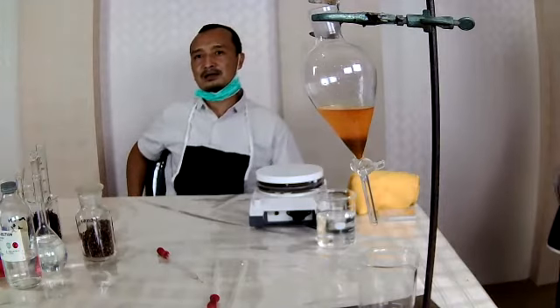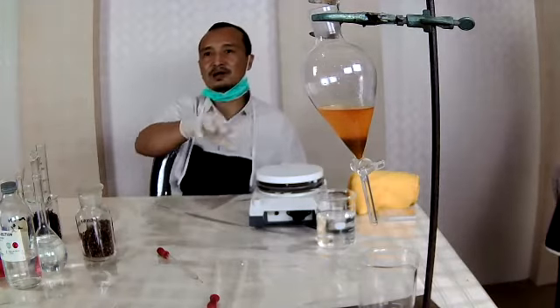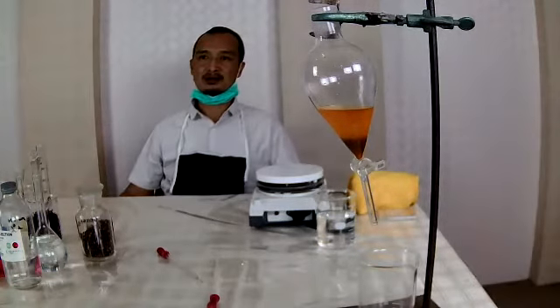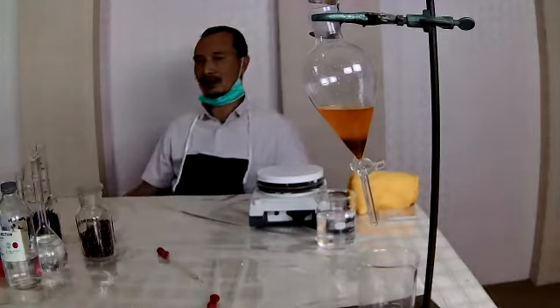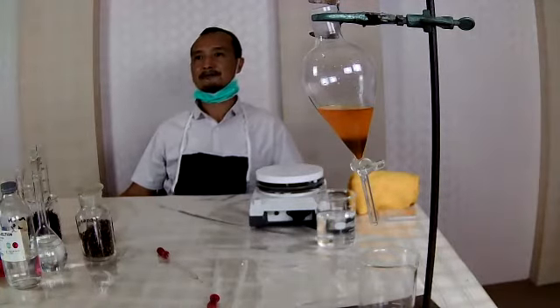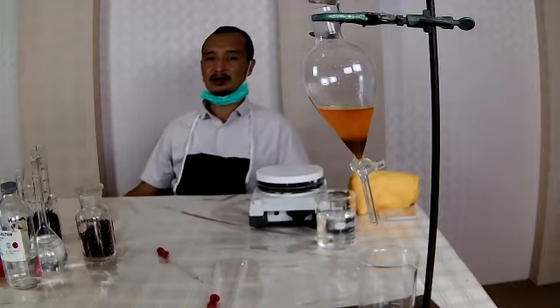And for the active ingredients extraction, we can wait for this to separate.